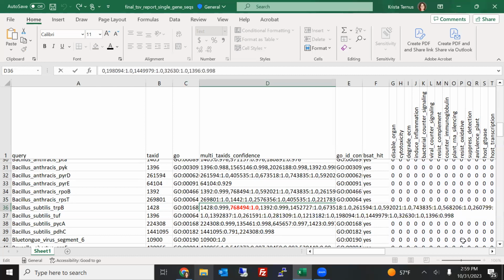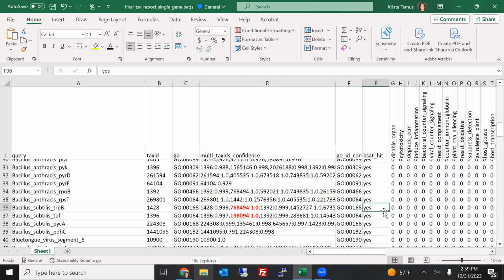So that tells me that this is a conserved gene, likely among the Bacillus genus, maybe further. I haven't gone through and looked at all these different tax IDs, but I can tell you that a lot of these are Bacillus. So this is something that is shared between Bacillus anthracis, which is on the BSAT list, and these other Bacillus organisms. And so when we look at the SeqMapper outputs, we see yes, but that doesn't mean that this is a threat. That just means that this sequence has similarity to something that is being regulated at the taxonomic level. So that's a very important point.